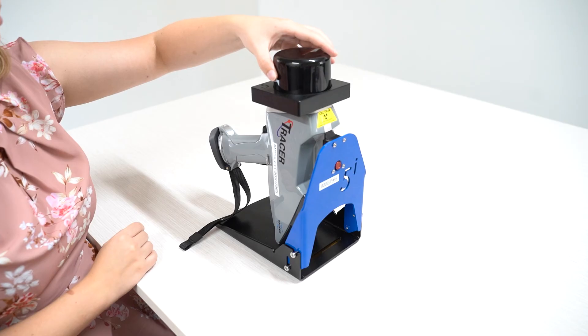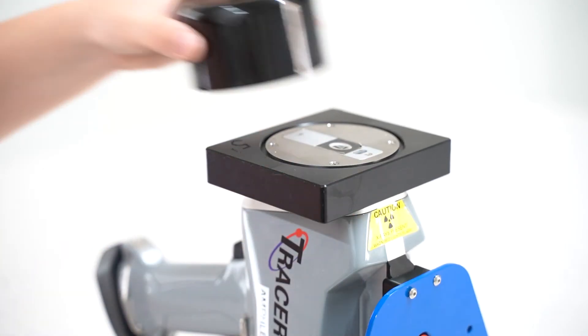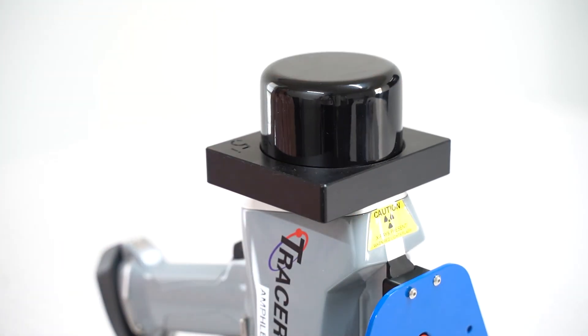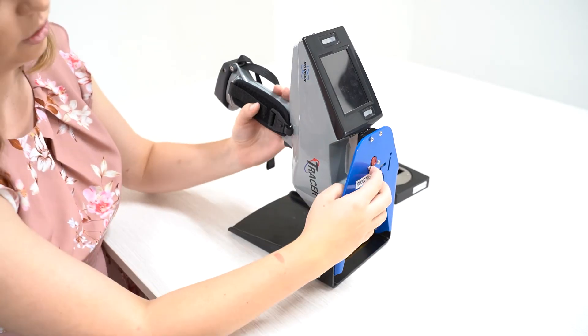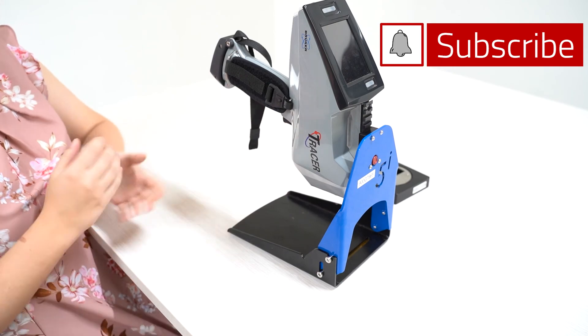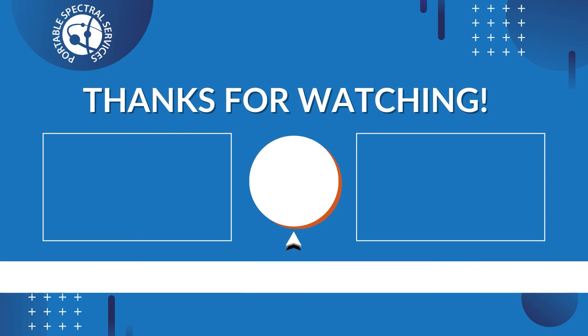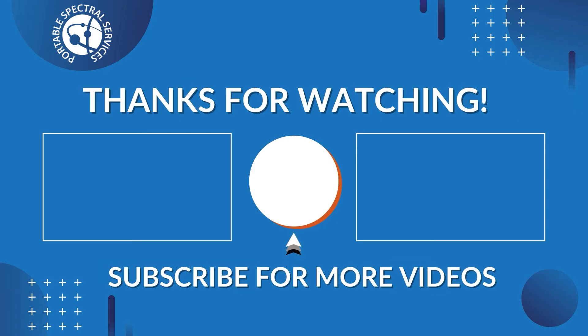As the lid is lined with lead, it provides additional radiation safety when analysing in the upward facing position. Because of this, in the downward analysing position, it is important to stay extra vigilant and adhere to radiation safety guidelines.